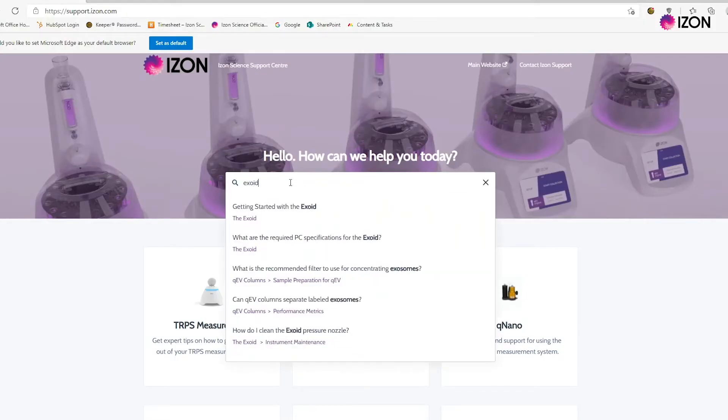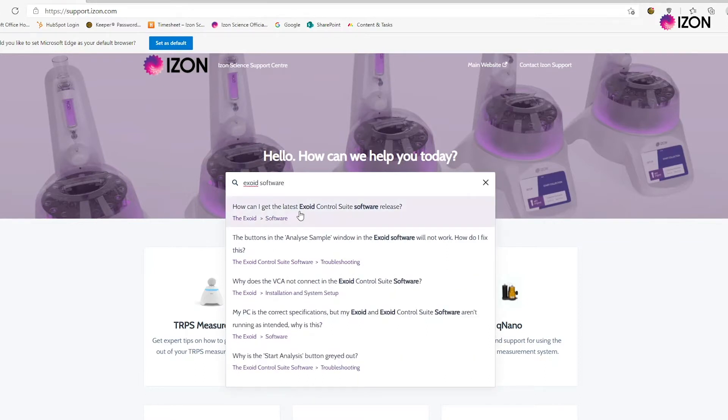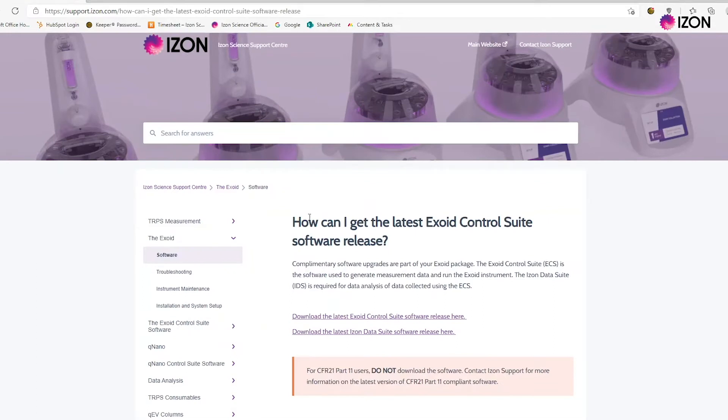Before you can start using the Exoid, you will need to install the Exoid Control Suite software, or ECS for short, and the iZon Data Suite on your computer to collect and process data respectively. These can be downloaded from support.izon.com by clicking the link on screen. Run the installation programs and install the software to the desired directories.